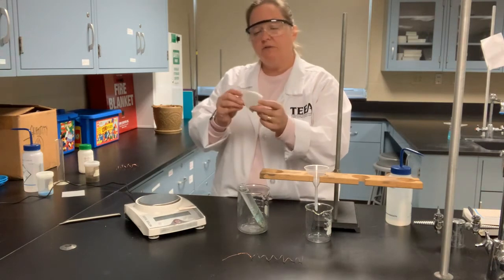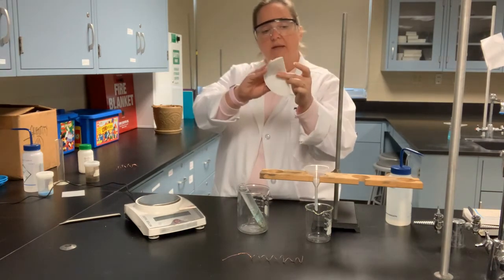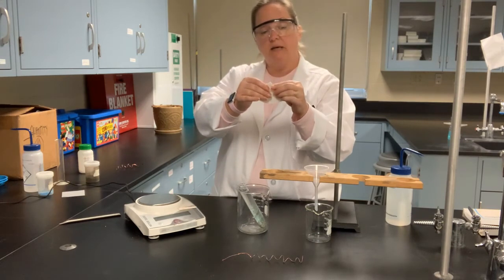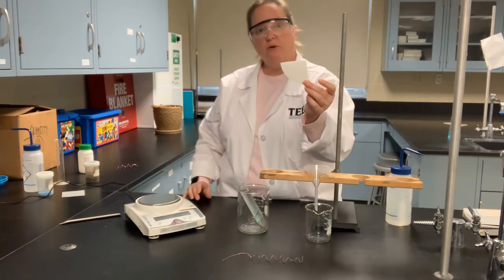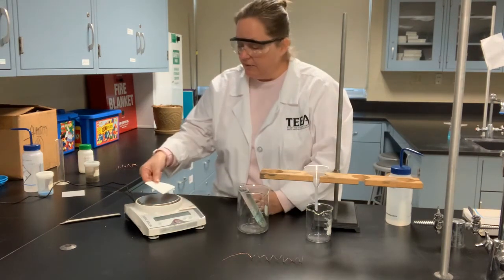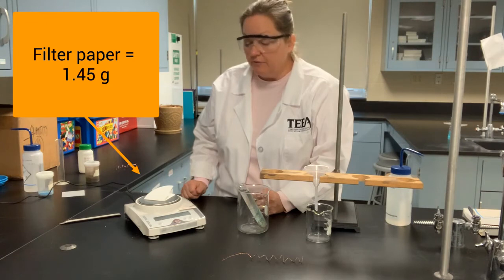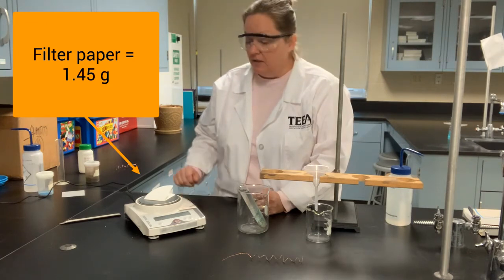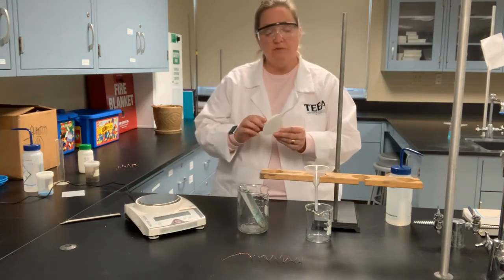So to fold the filter paper, what I did was I first folded it straight in half and then kept it in half and folded it a second time in a quarter. And then I just want to crease it gently. You don't want to crease it too hard because you don't want to make it weak at the crease. But I creased it gently, and now I can place it right on the center of the balance pan. And the mass of the filter paper is 1.45 grams. So this is the mass of the empty dry filter paper, 1.45 grams.